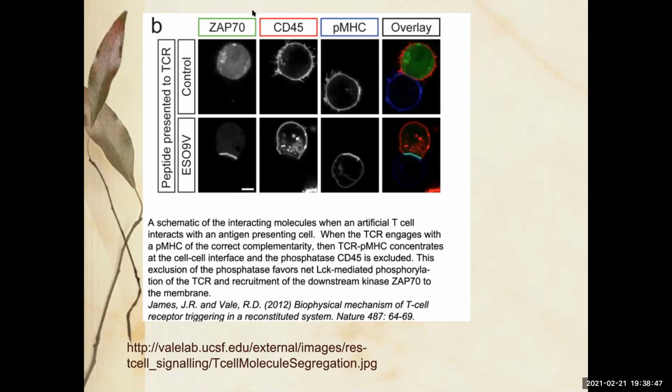and where is it? And you know that this black and white image was taken using your green channel. Why do you know that? Because you kept track. You're really good with GLP, good lab practices, and you keep track in your image log in your notebook. You keep track in the file name. Keeping track is the really important part of this.